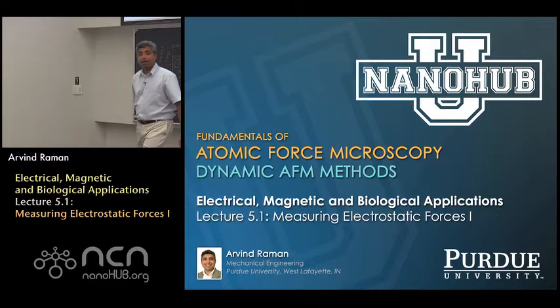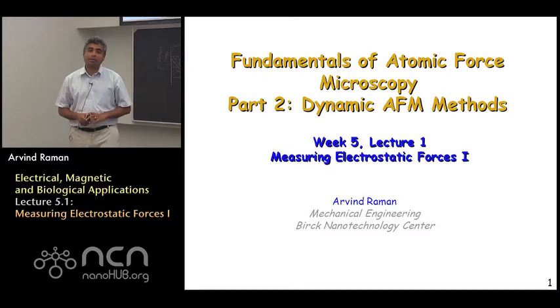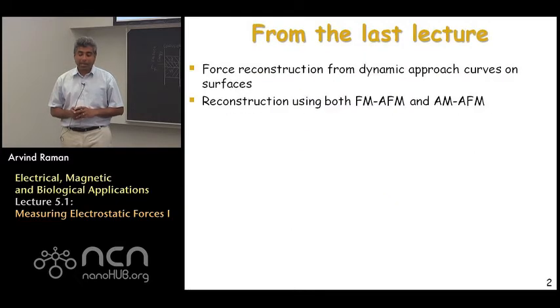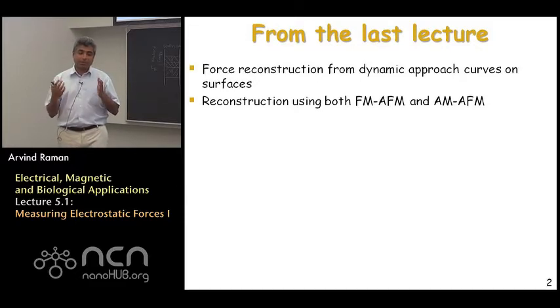nanoHUB-U, online instruction. Hi, and welcome back to week 5 of part 2 of Fundamentals of Atomic Force Microscopy. In this last week, we're going to focus on some additional topics that can be considered as extensions of the methods that we have studied in detail. In the last class, we were focusing a lot on the use of frequency-modulated AFM and AM AFM to reconstruct the interaction forces between the tip and the sample.